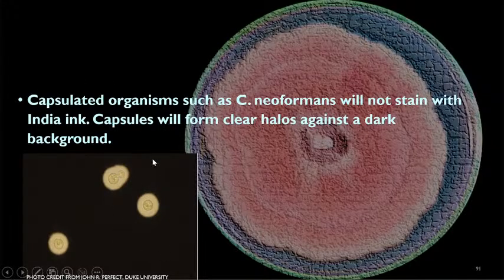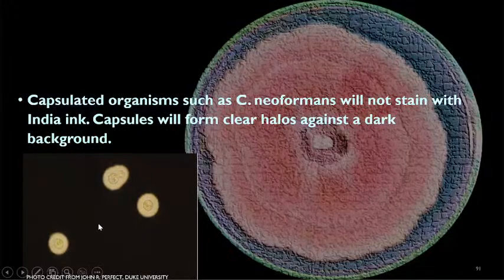Pag expired na ang reagent mo, like the ones that I have worked with in the Philippines, makikita mo, parang nag-clot yung black. Okay? So, itapon nyo na yon kapag ka ganun ang itsura.